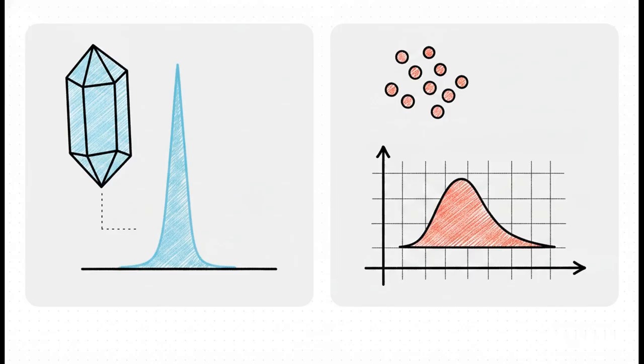But nanoparticles uniquely show broader, way less intense peaks. And the reason is simple. Because the particle is so unimaginably small, there just aren't enough atomic planes to perfectly cancel out that slightly off-angle scattering. So that peak broadening isn't a mistake or bad data. It's actually a vital clue about the nanoparticle's true dimensions.